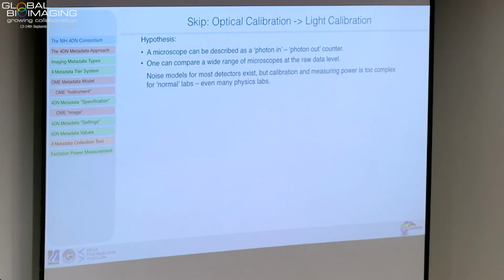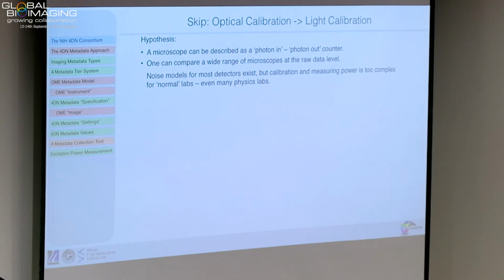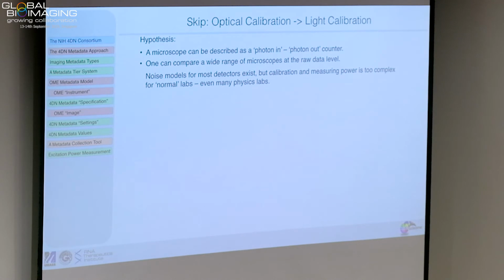So at the level of raw data, if we know how many photons are under a PSF or how many photons are in a structure, what the noise characteristic of that image is in photons, how that statistically behaves, we can make general statements about the information content of these images. And that gives us a first gauge on, is it realistic that that data set that has basically fewer photons in the signal than that other data set gets 10 times its resolution?